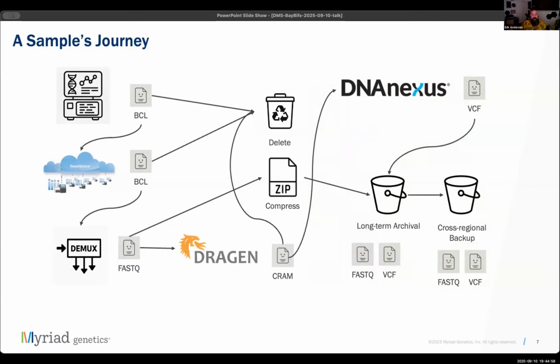Let's walk through how all this works together in the real world. Malika has already described in detail how our whole genome sequencing pipeline works. How does its data fit into the picture? Let's take a look. So our sequencers spit out the BCL files, and those BCL files are then uploaded to BaseSpace. The BaseSpace BCL file is then used in ICA in the demux operation that creates these FASTQs. Those FASTQs are then used in the ICA DRAGEN alignment to create CRAM files. The CRAM files are copied to DNAnexus, where they are run through the variant caller to produce VCF files.